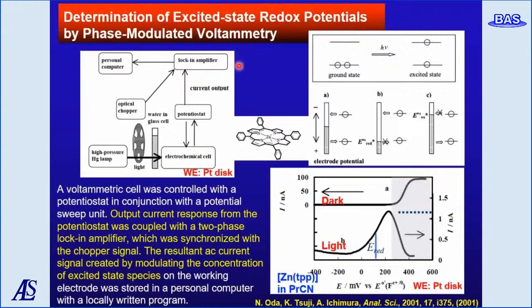Schematically, if the HOMO-LUMO electron exchange in the excited state of the electrode and the molecules is equal, the total current is not observed. However, when the potential is shifted to the positive side, the electron in the LUMO undergoes electron transfer to the empty electrode conduction band, and the reduction current is observed. The potential on the positive side at this time indicates the reduction potential at the excited state.